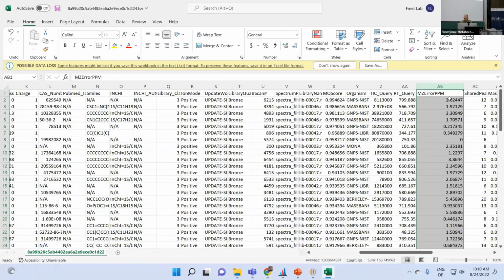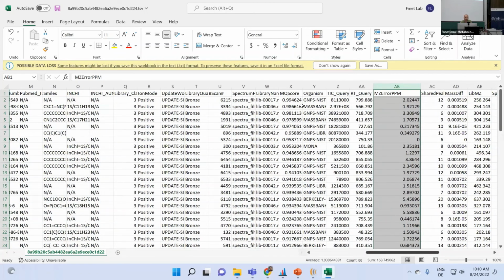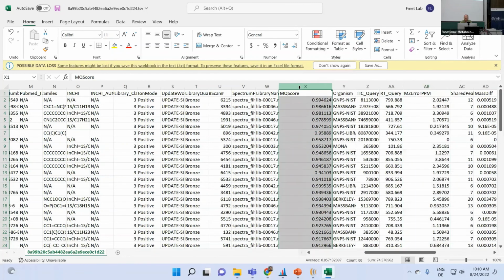So this is a very important thing. And then obviously the cosine, which is here called MQ. Again, apologies for the confusing naming, but due to historic reasons, it was hard to change that and make it uniform to cosine or so. So here it's MQ.